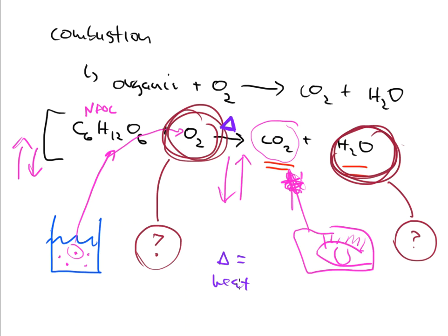If not, I'm going to be here forever. Okay? So this organic molecule mixed with O2 and some heat will give me CO2 and water. And this detector and this instrument will measure that CO2 that's getting pumped off. And the higher level of CO2, the more contamination that I have. All right, in a nutshell, that is what the TOC analyzer is doing.